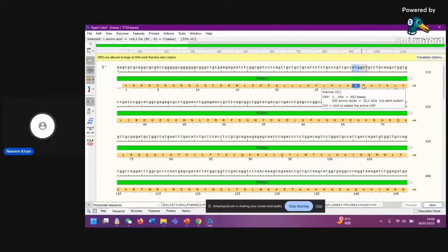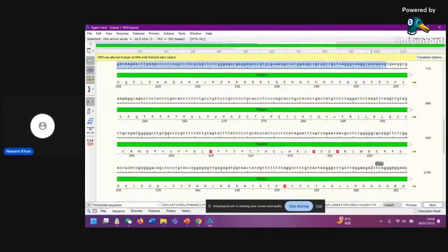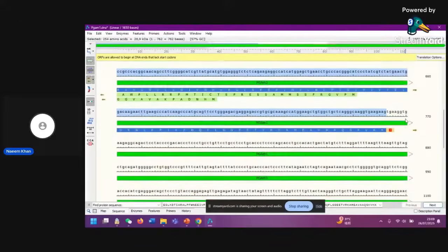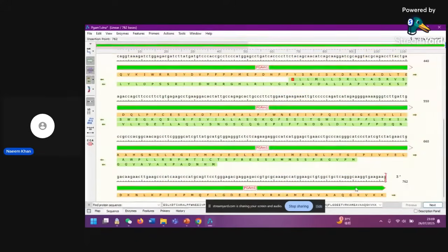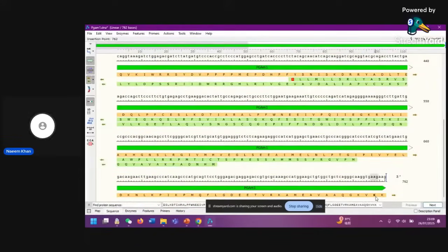M is methionine, which starts the expression in any expression system. So these are all extra nucleotides, and we should delete these nucleotides. And similarly, at the end, if you have some extra amino acids, we must also delete them, from the KVKK onward. After this, we must delete this sequence because it is extra. So the starting region is MAAY and the end region is VKK.